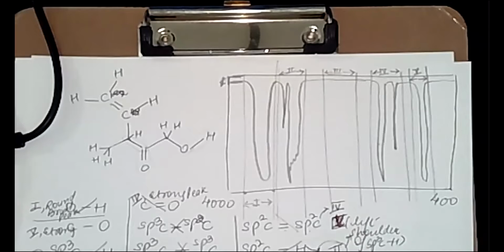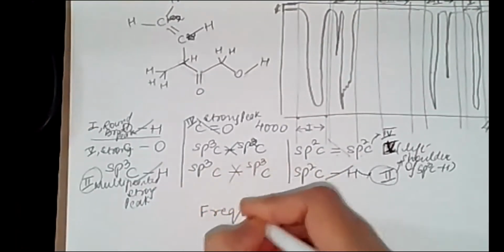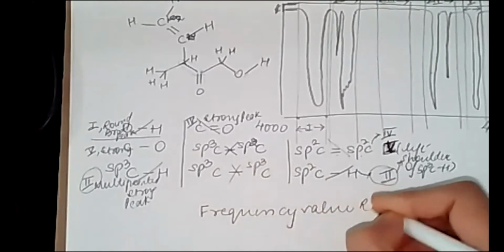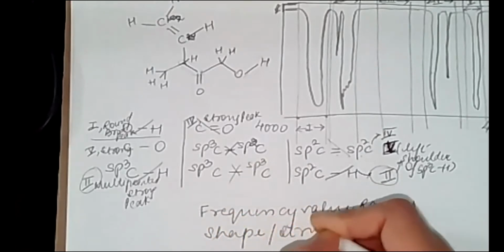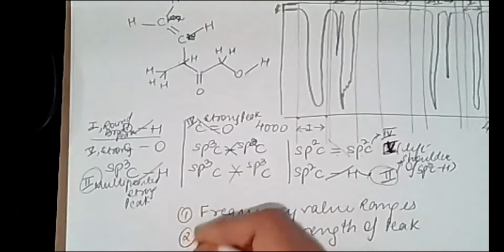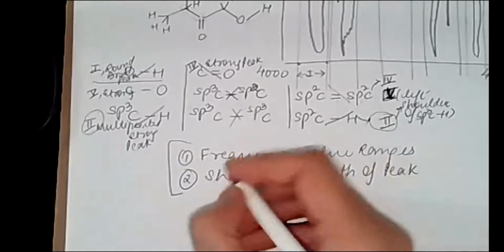You always have to give the frequency value ranges, the shape and strength of the peak. So these are the two things by which you define your peaks.